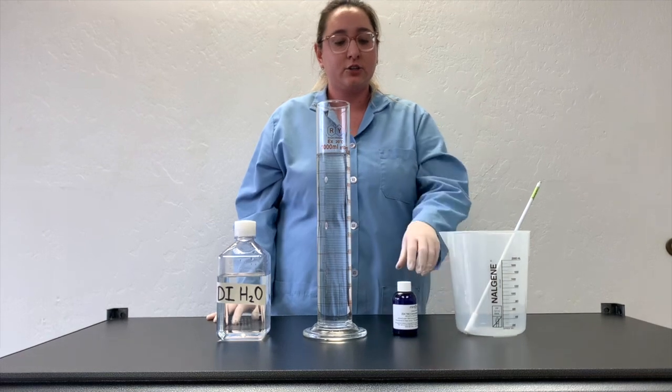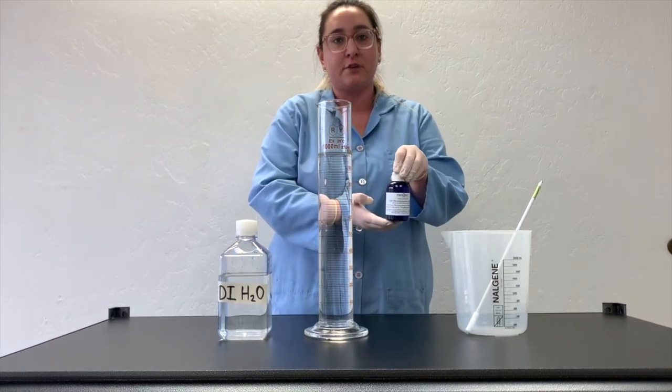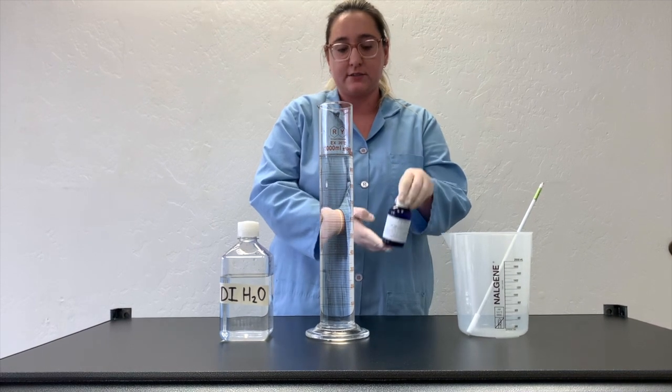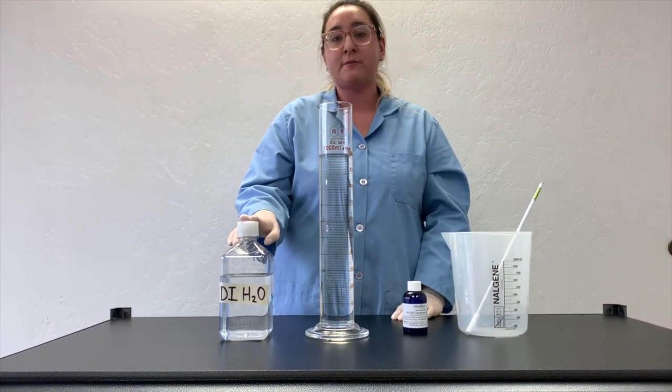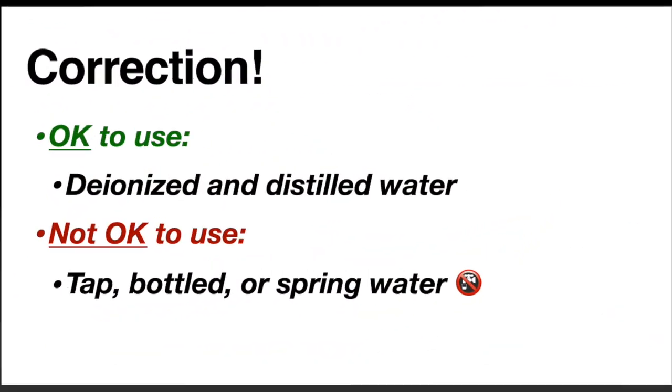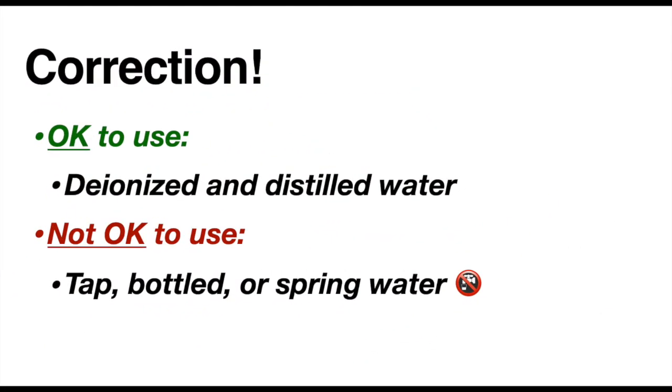To begin, you're going to need your 20x TBE buffer concentrate bottle that should be included in your Minilab kit, and water. We recommend you use either DI or bottled drinking water.